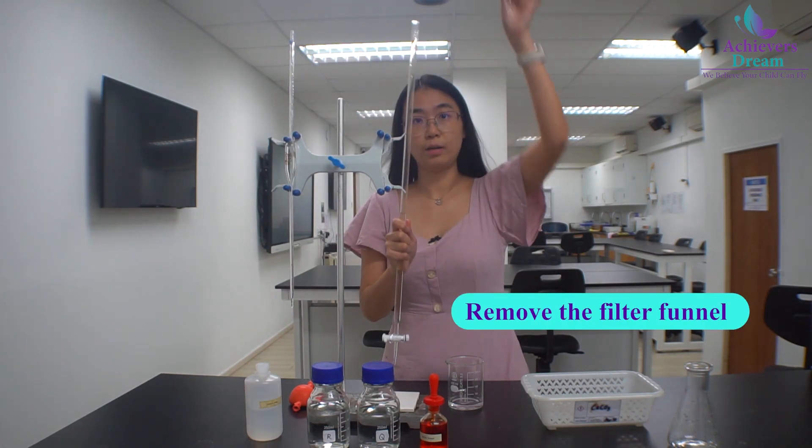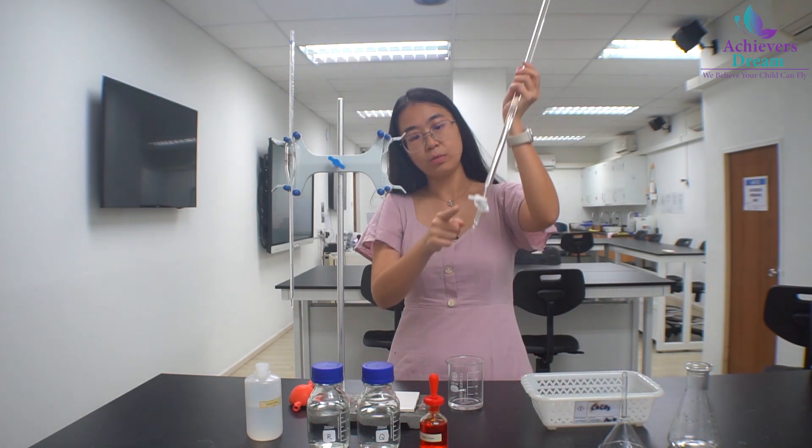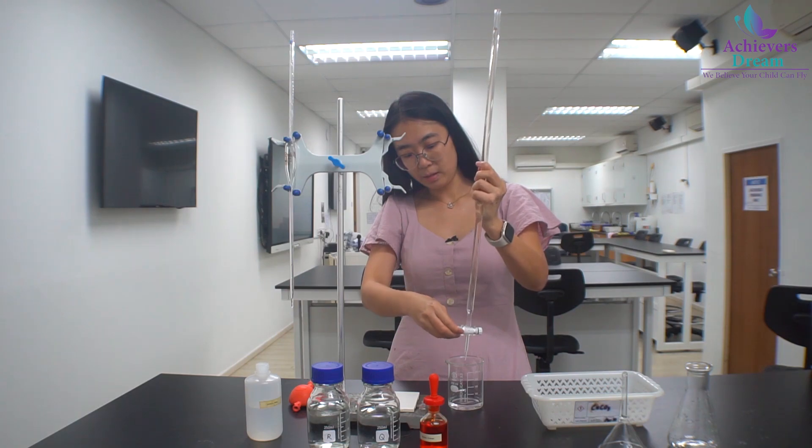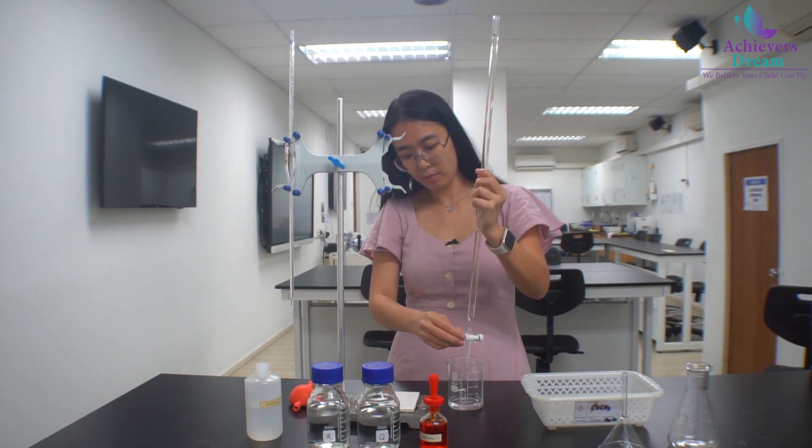Remove the filter funnel. Remember to rinse the tip. Now open the stop cork and let the distilled water run.